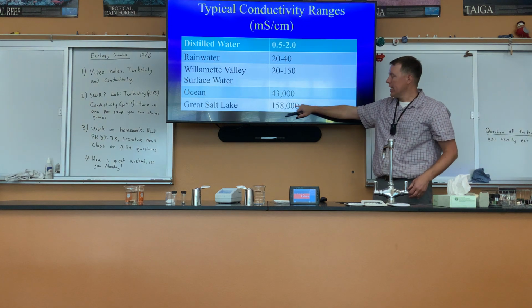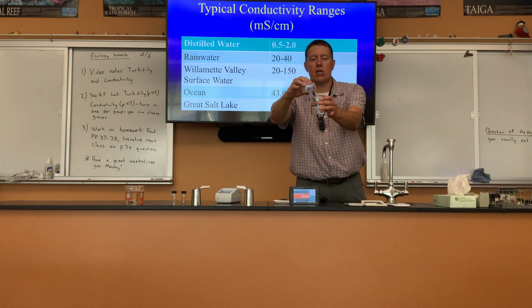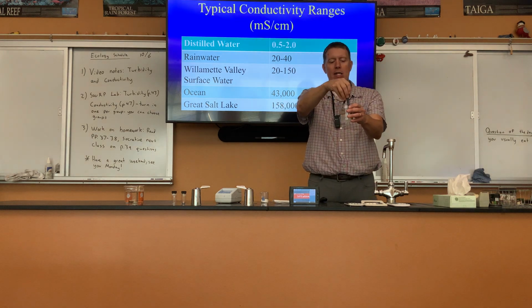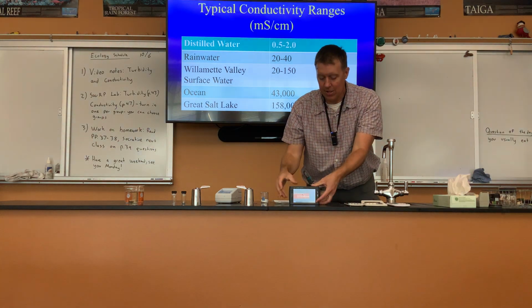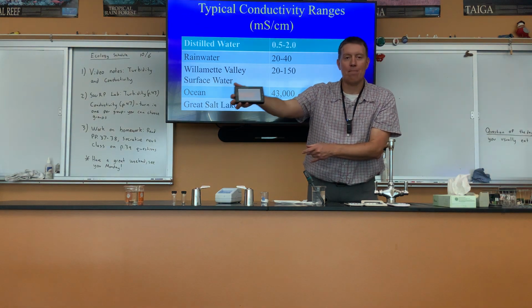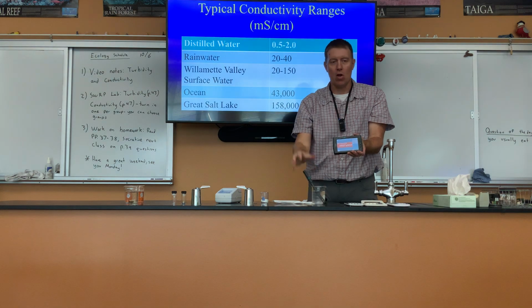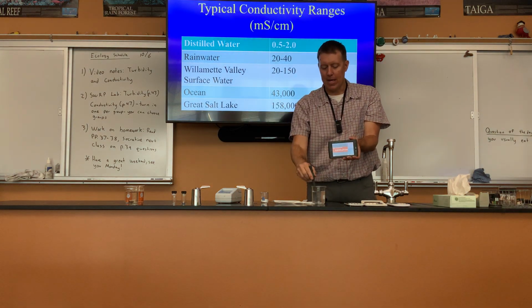But if you get salty water, like if I add salt into the water here and sort of stir that around, now because it has salt in it, it's probably going to have a little bit higher conductivity. So I read that, and yeah, it's not only a little higher, it's now up to over 10,000 just by adding that salt in there. The salt ions, the sodium and chloride in there, made it raise up quite a bit.